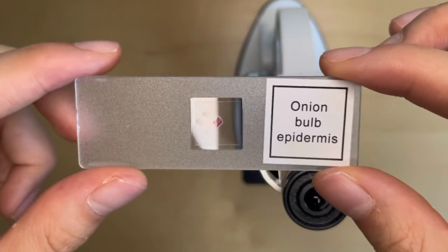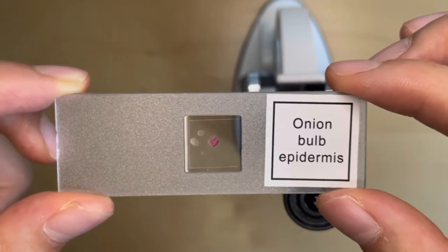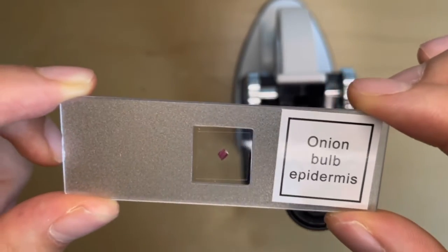When you first see this, you may be like, what? Onion? Okay, bulb? That's okay. Epidermis, which is the least okay.